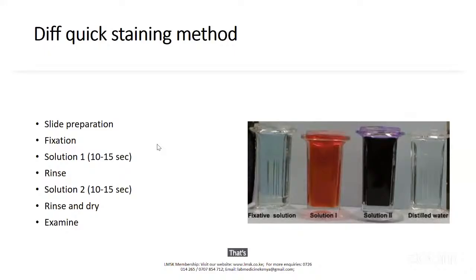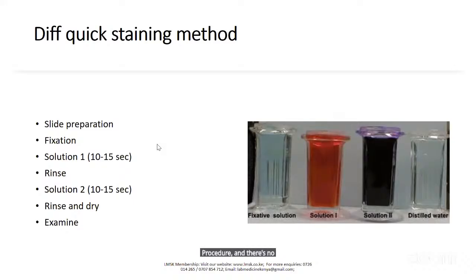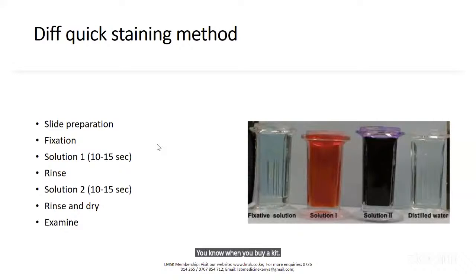That's noted. Kevin Osundwa asks, there are some manufacturers who produce their own procedure and there is no rinsing, or is it a must? Okay, my take is, when you buy a kit, there's always a deviation in the timings, even in the normal histology, like the H&E techniques.